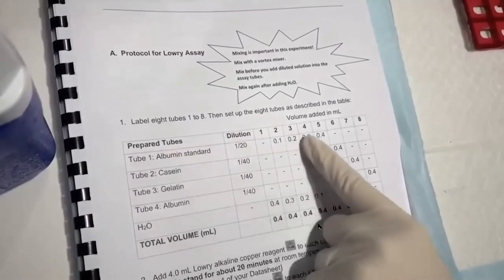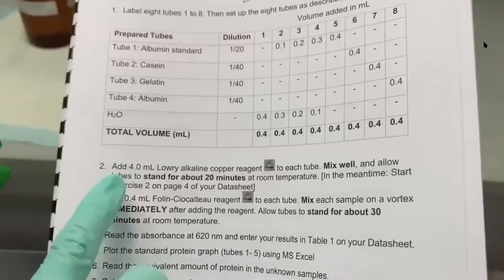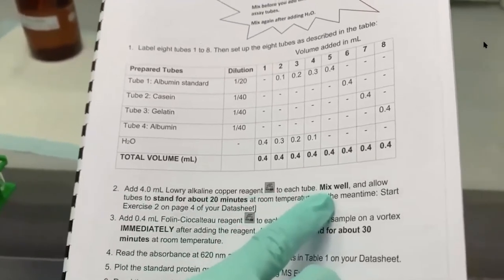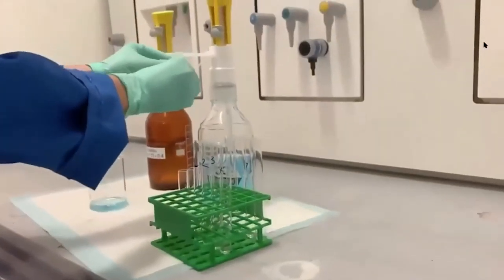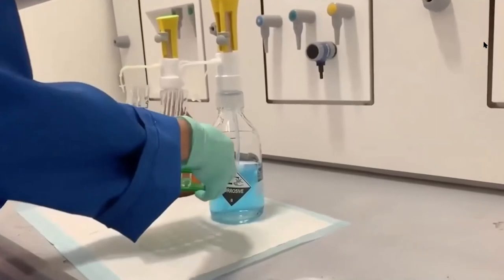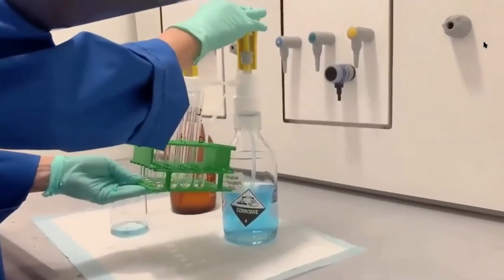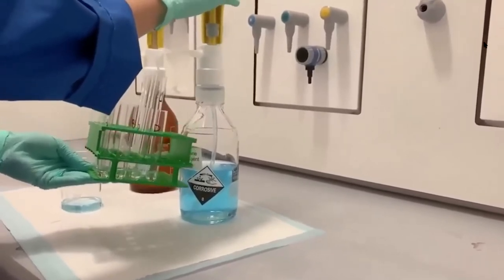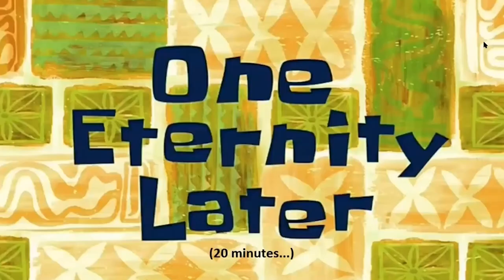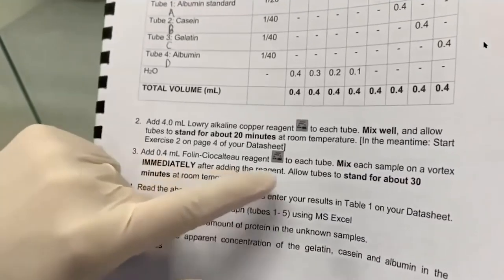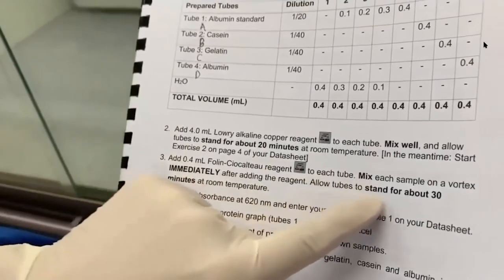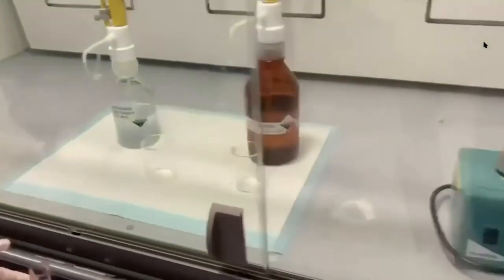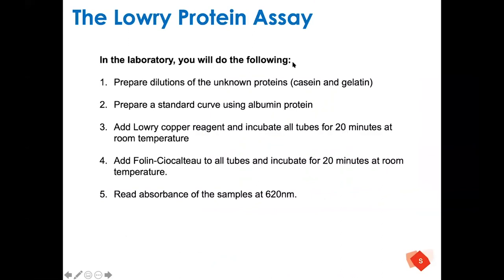Next, we'll label our tubes 1 through 8. We're heading over to the fume hood to add our Lowry reagent. You just lift up the preset dropper and drop it into the tube, and it will dispense 4 mils of our Lowry reagent into each of the tubes. Following that, we mix it and leave it to stand for 20 minutes at room temperature. The next step is to add the FC reagent — same principle as the last step: lift the automated dispenser and drop it, and that will add 400 microlitres of the reagent into each tube.